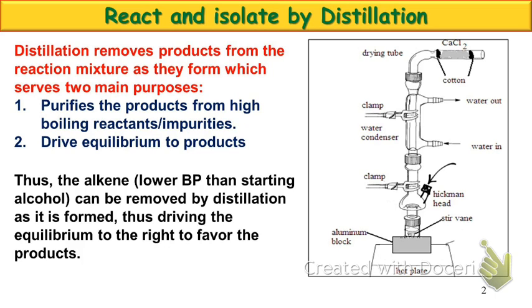Does your Hickman head not have a side port? No, we just have enough time for distillation. Yeah, we just attached it to the water condenser. Oh, well, why didn't you tell me you didn't do a distillation? We just did the water condenser. Okay, so we omitted that part. Yesterday's section wasn't very nice then, because they didn't tell me they didn't do a distillation. They were all happy with it. So, new glassware setup then.